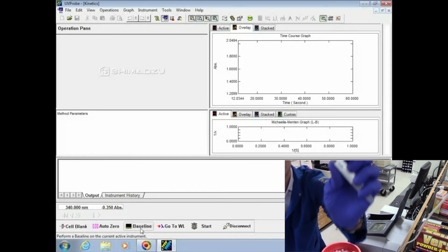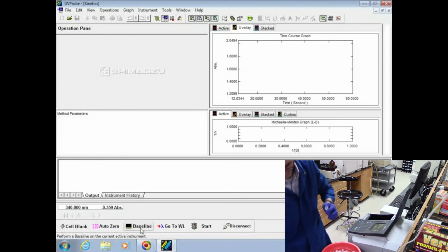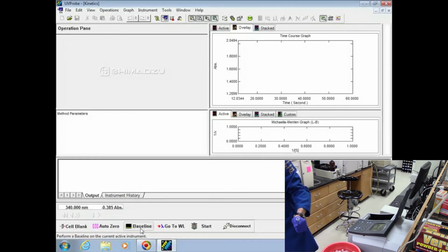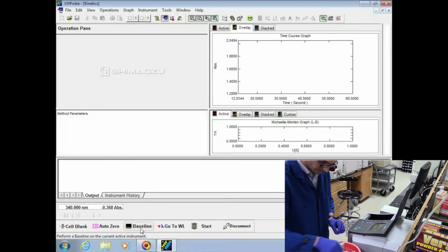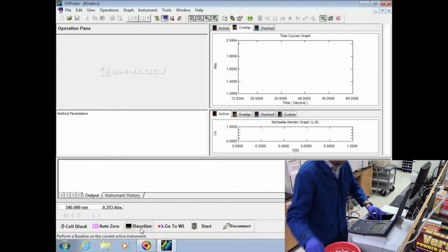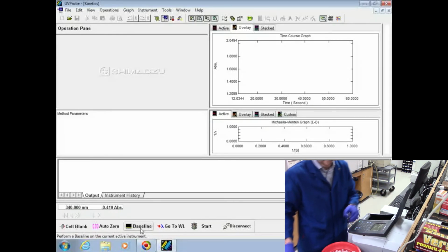Next, pipette the oxaloacetate. Again, pipette the calculated quantity of oxaloacetate for the substrate concentration that you're expecting to use into the cuvette and mix thoroughly. Place the cuvette back into the sample cell in the front cell. Note that the absorbance for the sample increased to a calculated amount dependent upon the concentration of NADH.